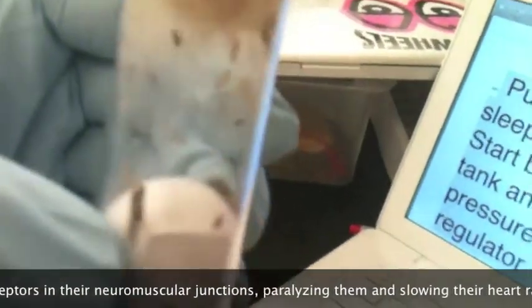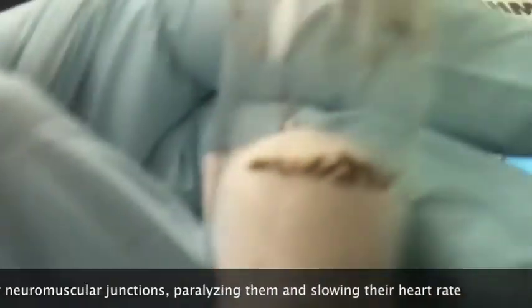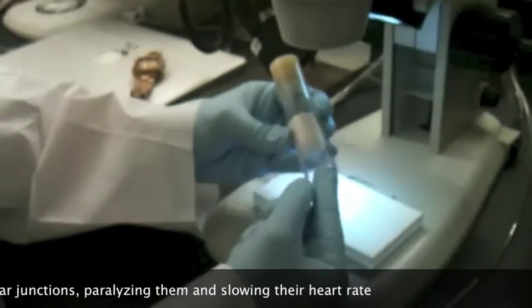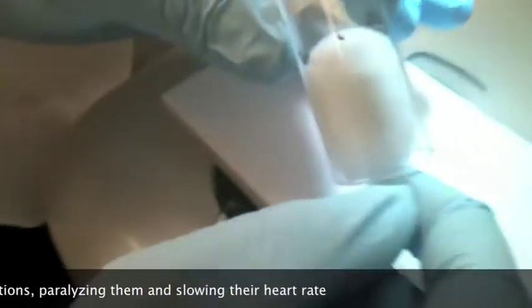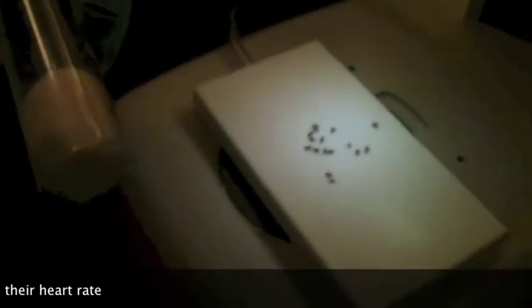The flies will start to fall asleep. Then pull out the cotton and let the flies fall onto the fly pad. The fly pad emits CO2, so the flies will stay asleep while you're working with them.